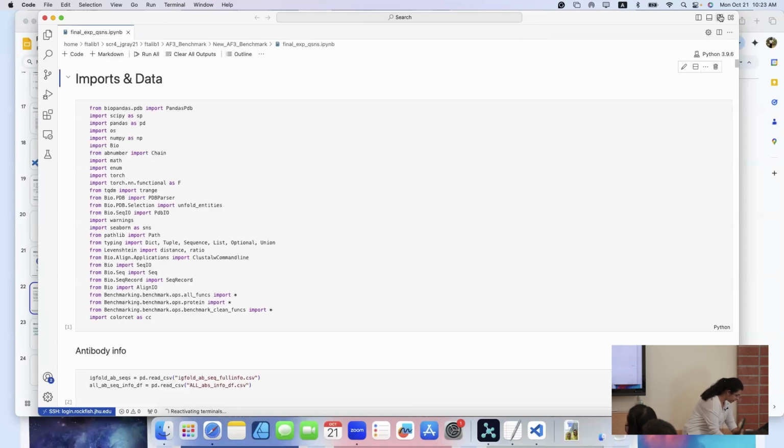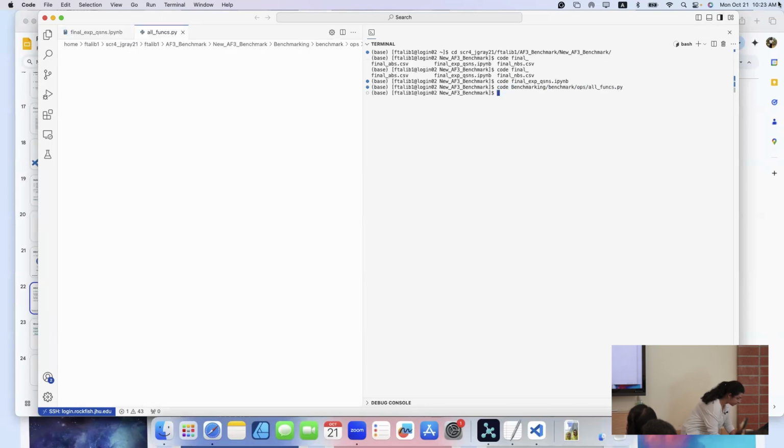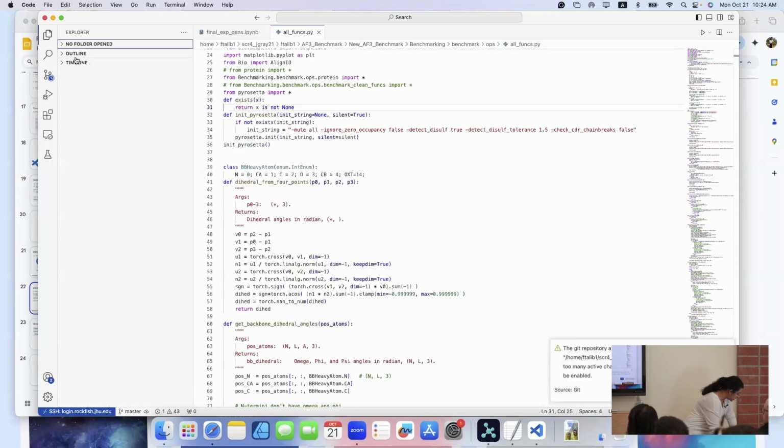This is a Jupyter notebook that I have, and then I also have a Python file. The nice thing with this is, if you see at the very top, I have basically my file path laid out. If I grab this, then I can go between different Python files in here. And if I have my Git repository attached, then I can put it in here. I haven't updated it, but all of my stuff would pop up over here.